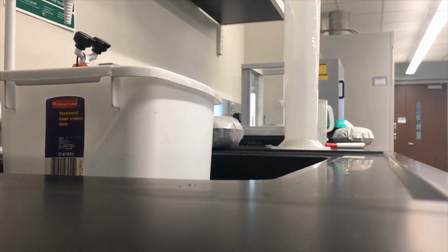Might need to refill the water a little bit. There we go. Okay, so now let's do that again.